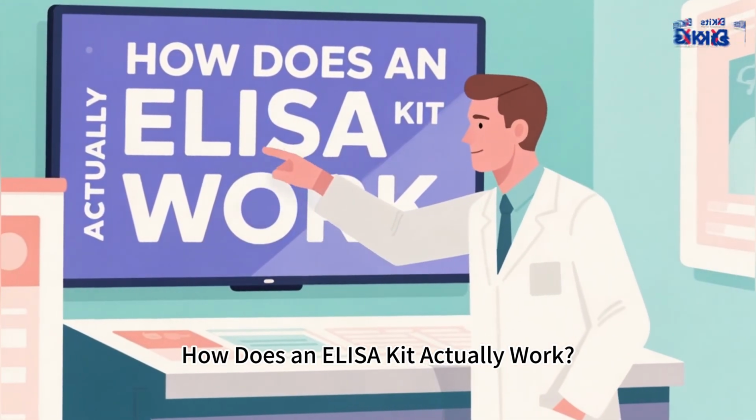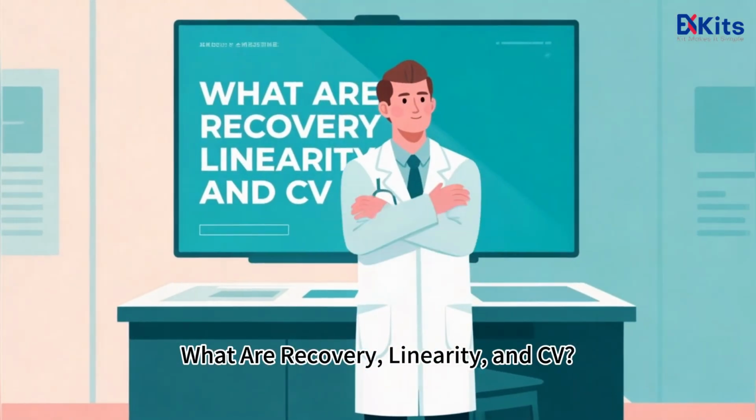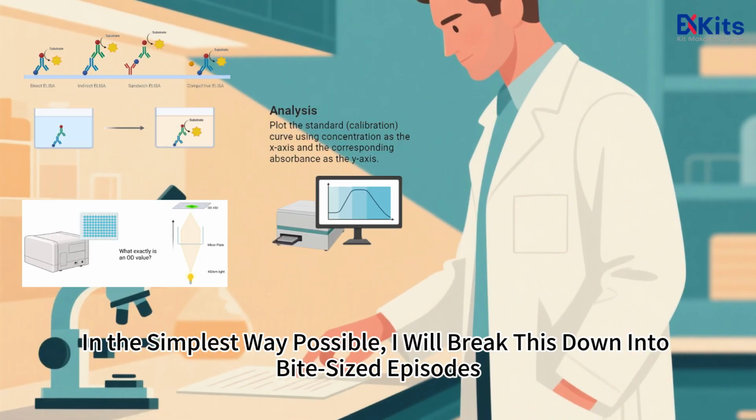How does an ELISA kit actually work? What's the difference between sandwich, competitive, and direct formats? What are recovery, linearity, and CV? How do you pick the right kit? And what if you want to build your own kits? Come along, Gil will walk you through all of it in the simplest way possible.